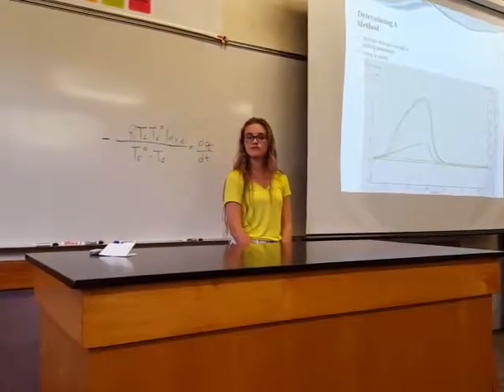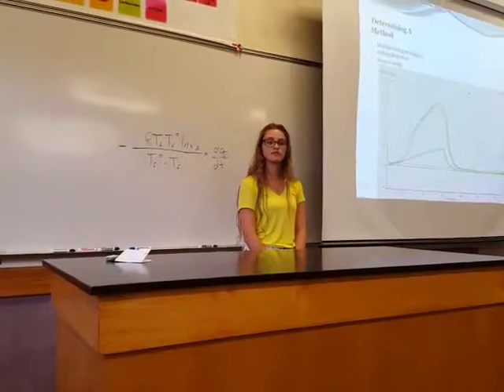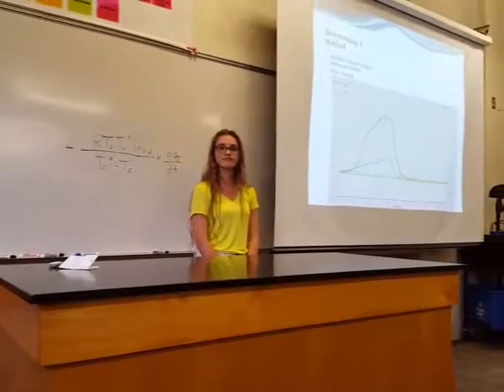Oh, so you are going to dilute the blood with the LB broth? Just a tiny little bit of blood would be put into it. Oh, okay. I thought it was going to be... Okay, that makes more sense. Okay.